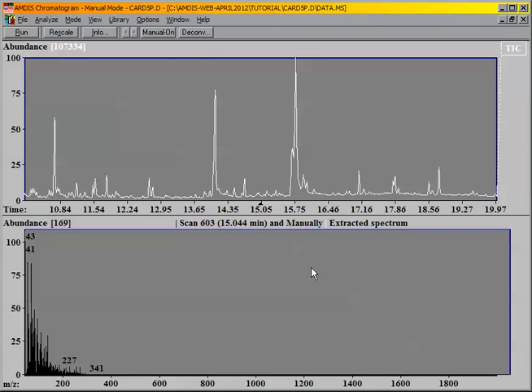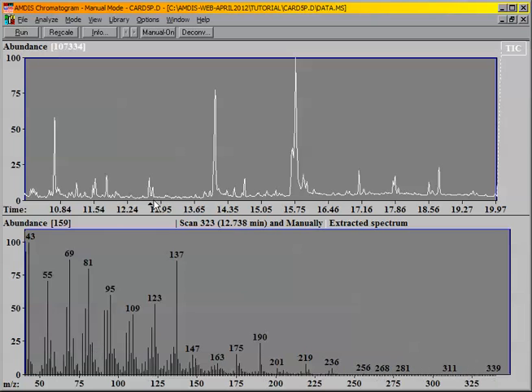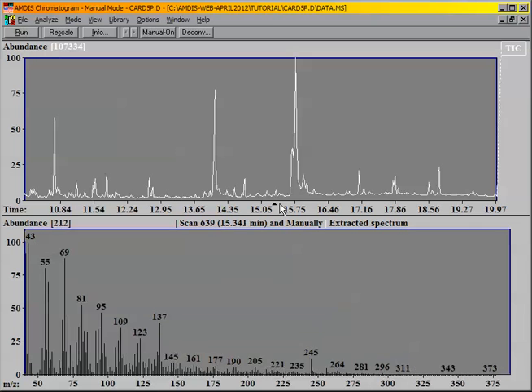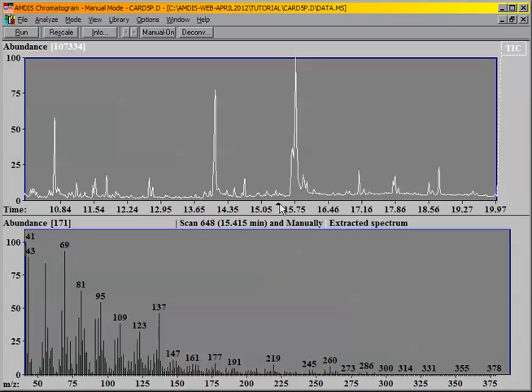And when I do that, I bring up a window up here that has the TIC and typically some random scan someplace in the data file. It's just exactly that, a scan. I can go any place on here. I can look at what an individual scan looks like, any place along here. I can click the forward arrow and I can scan through that.